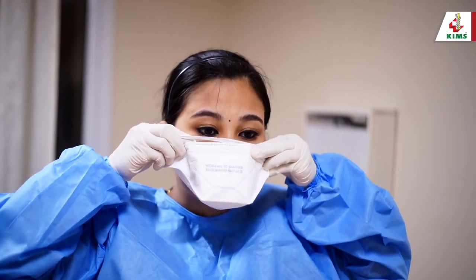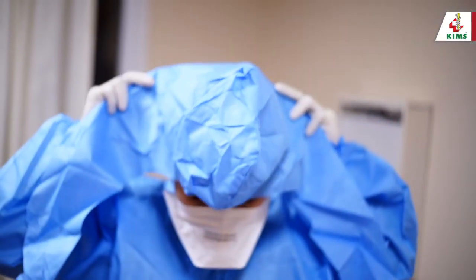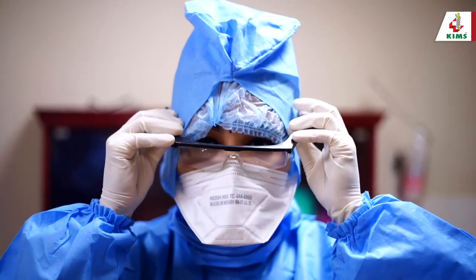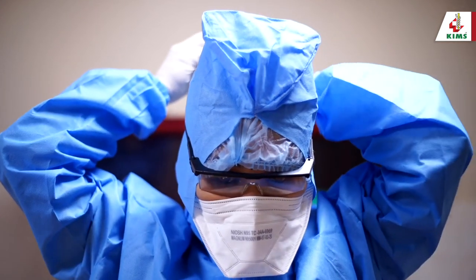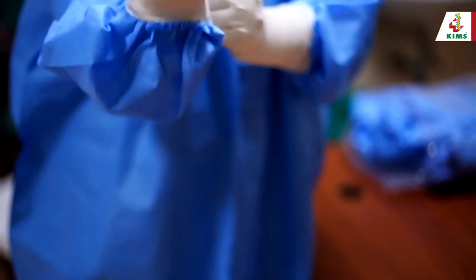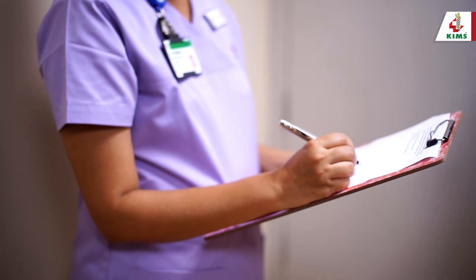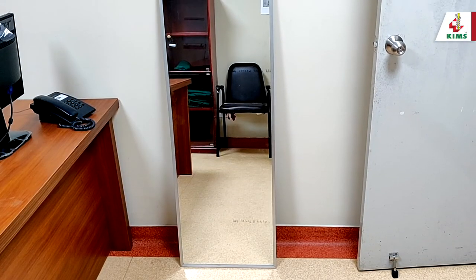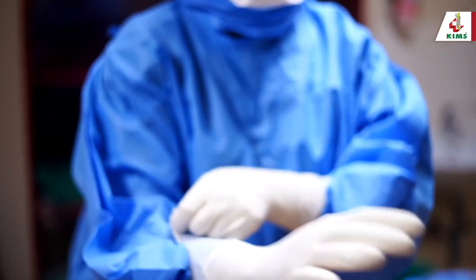Now wear the respirator. The hood is worn separately — wear the hood so that it overlaps the gown and covers the head and neck fully. Place the face shield or goggles over the hood, and if goggles are used, make sure they are secured with straps at the back of the head. Now put on the second pair of gloves and extend the cuff over the gown. A trained observer verifies that no part of the body is exposed before you enter the patient care area. Alternatively, you can use a mirror and verify. Make sure you can move around with the PPE. Now you are ready.